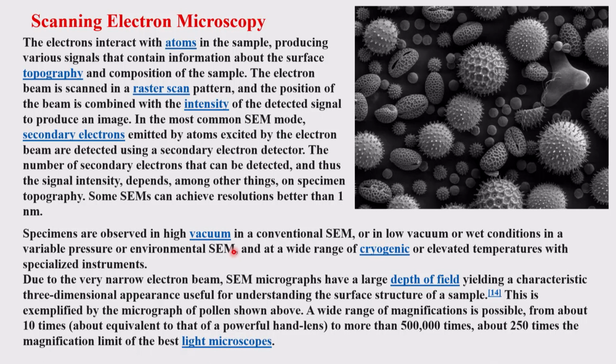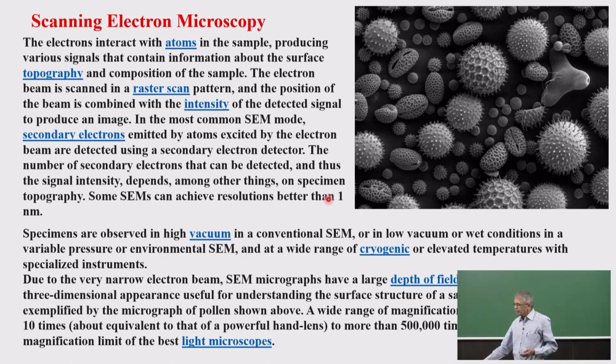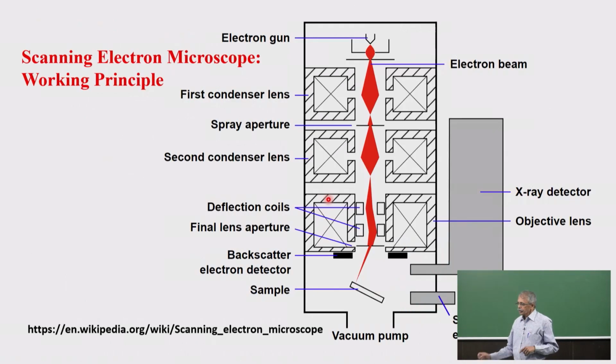All kinds of particles have been identified, and you can get quantifications of these as well. You may not get the interior of each of these in detail, but in some special cases you can go to the nanometer level, even up to 1 nanometer, though in fewer cases. Still, it gives the surface as compared to that of the TEM.